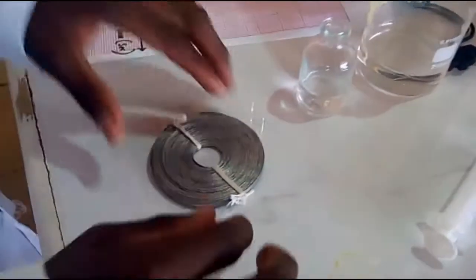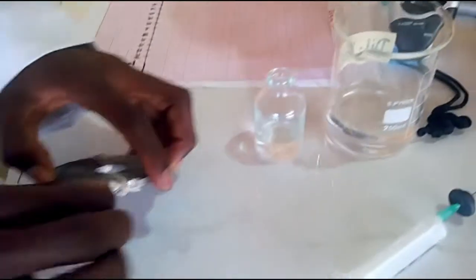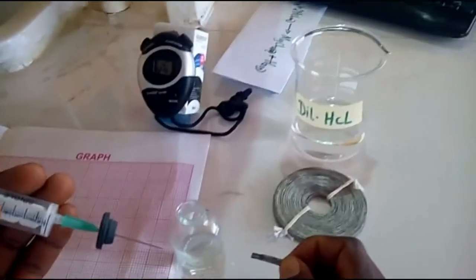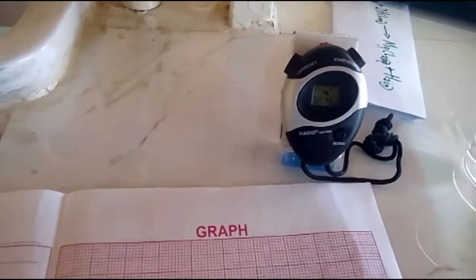Step 3. Put a cut piece of magnesium ribbon inside the reacting vessel and quickly cover it with its lid. Before we start, my mate will be recording our values at an interval of 2 seconds.